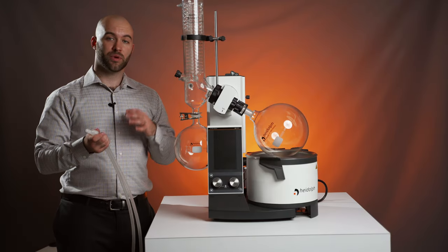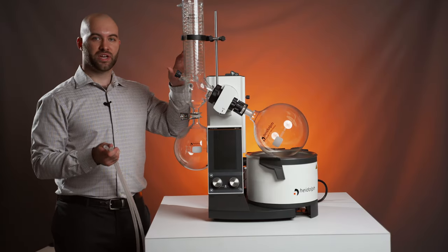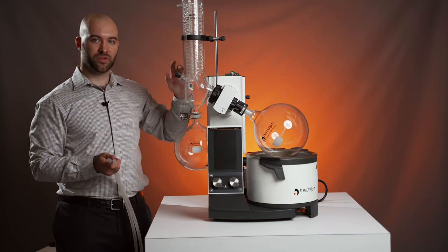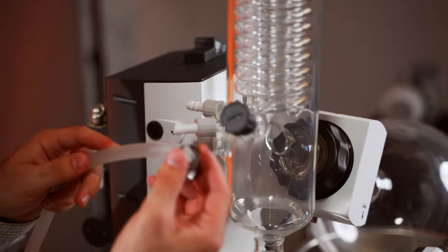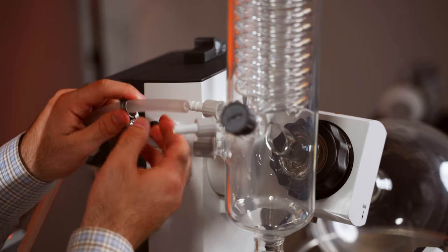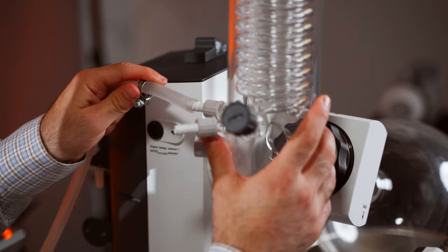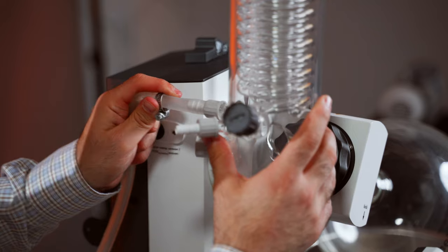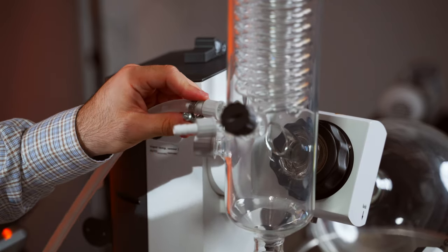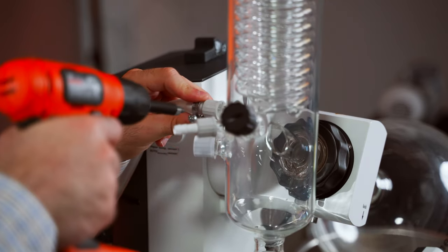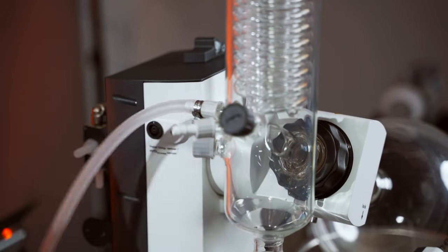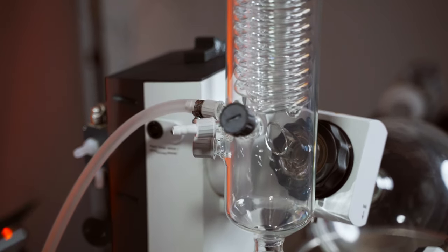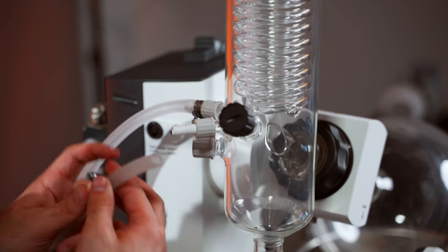Now we're going to attach the tubing that we just attached to our chiller to our condenser and due to its dual coil design, it doesn't matter which of these two connections is in or out. We're going to put the clamping ring over the tube first, slide the tube over the barbed connector, bring up the ring clamp and clamp it down. We'll do the same thing with our second piece of tubing.